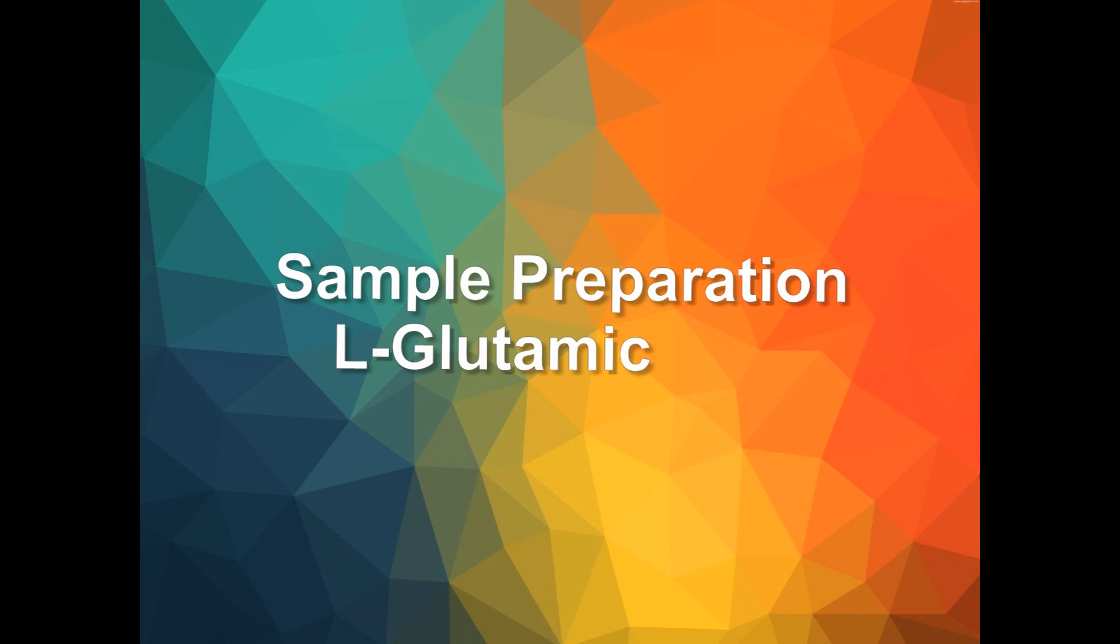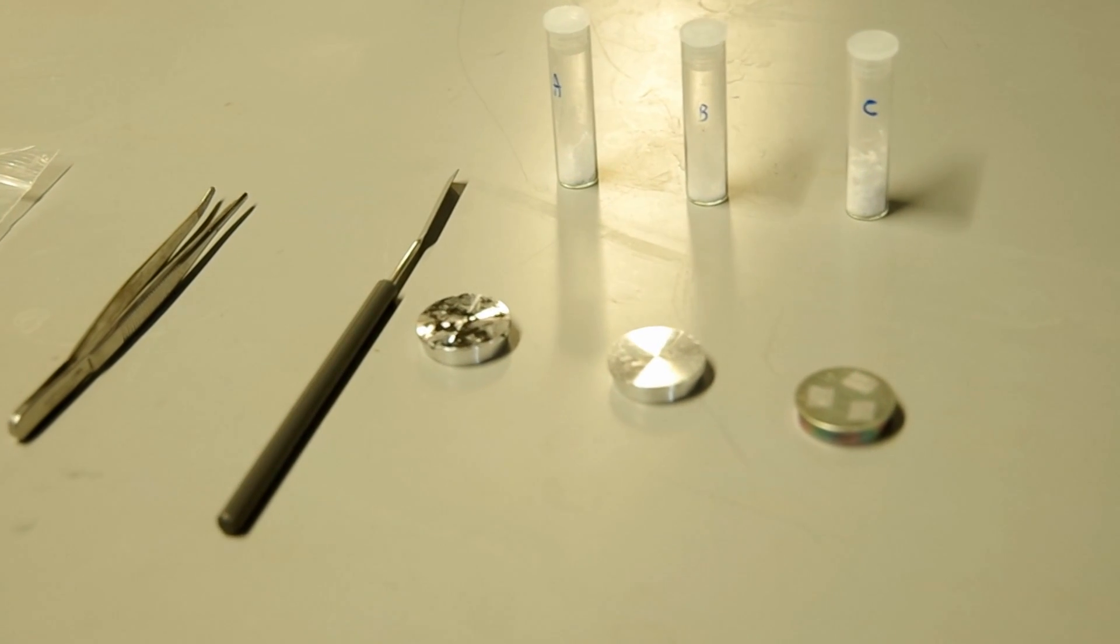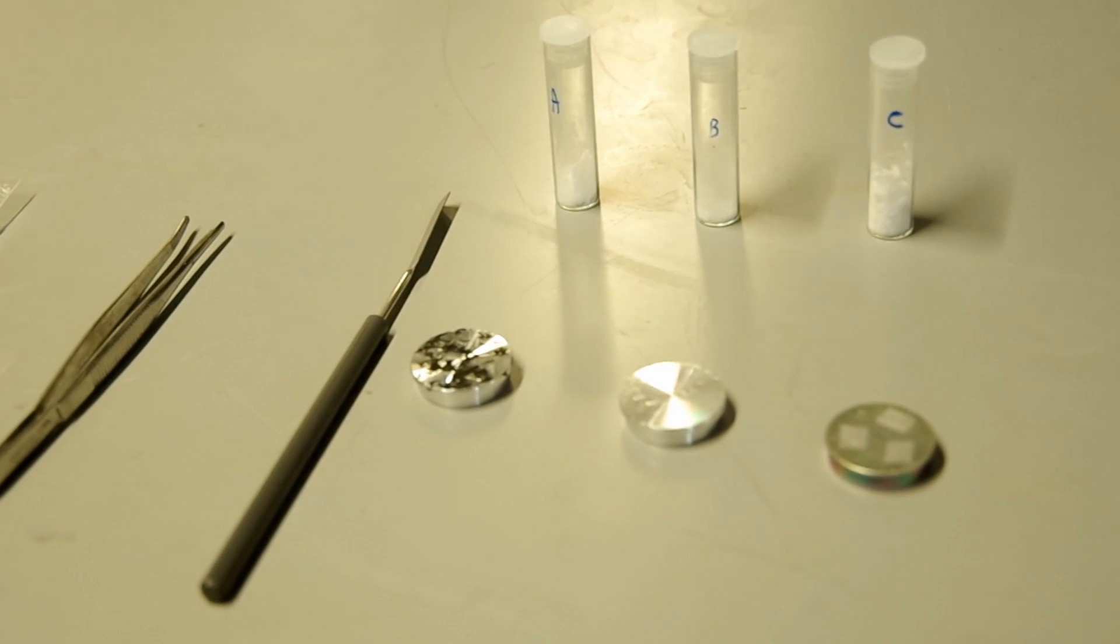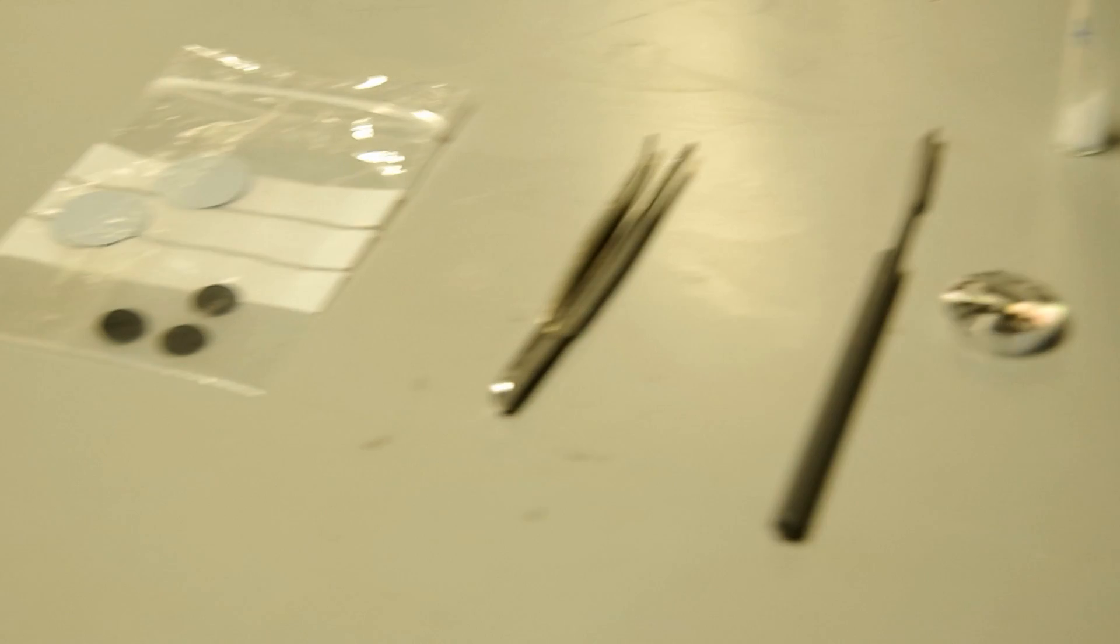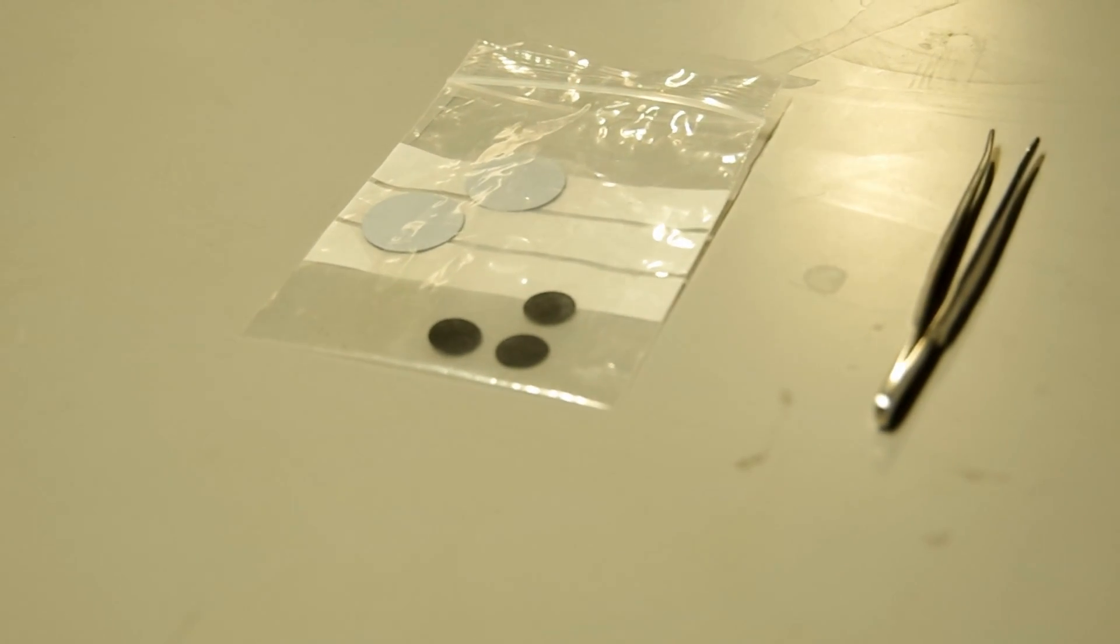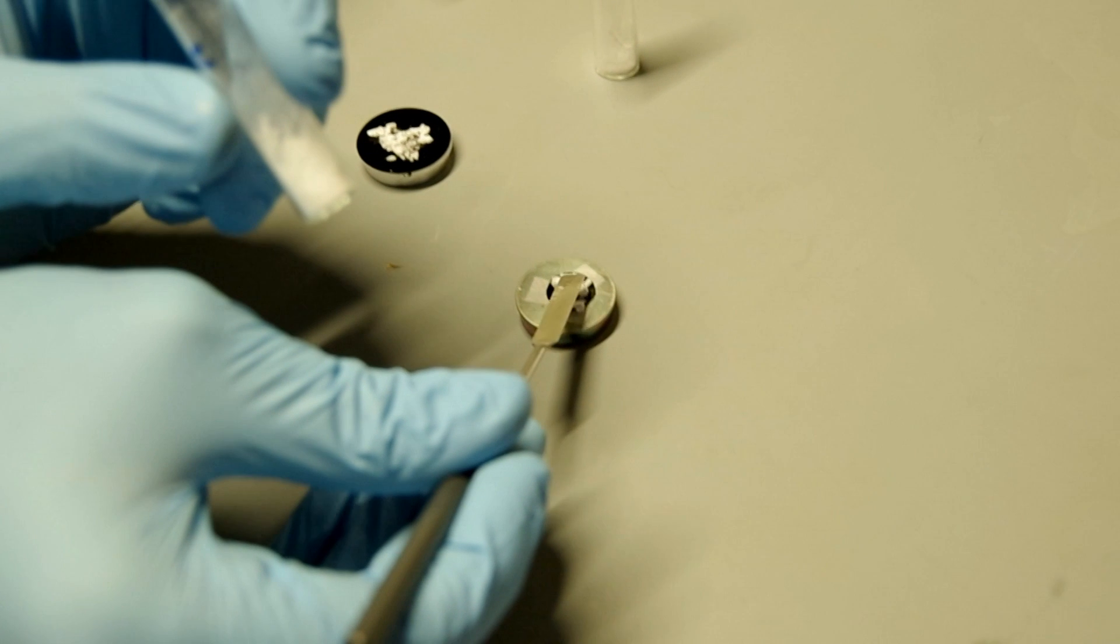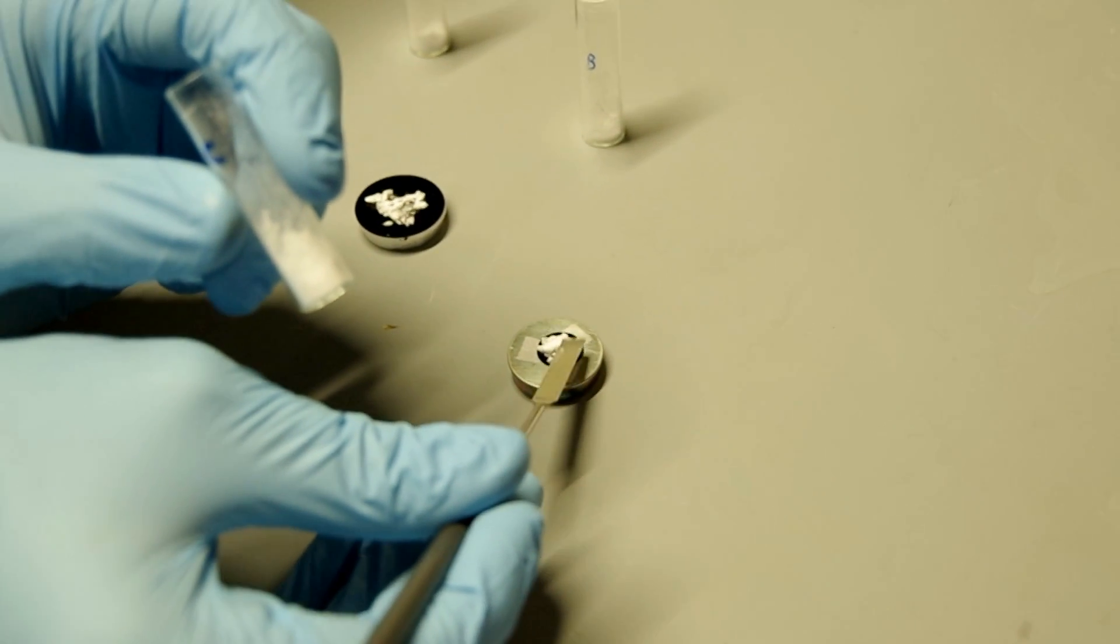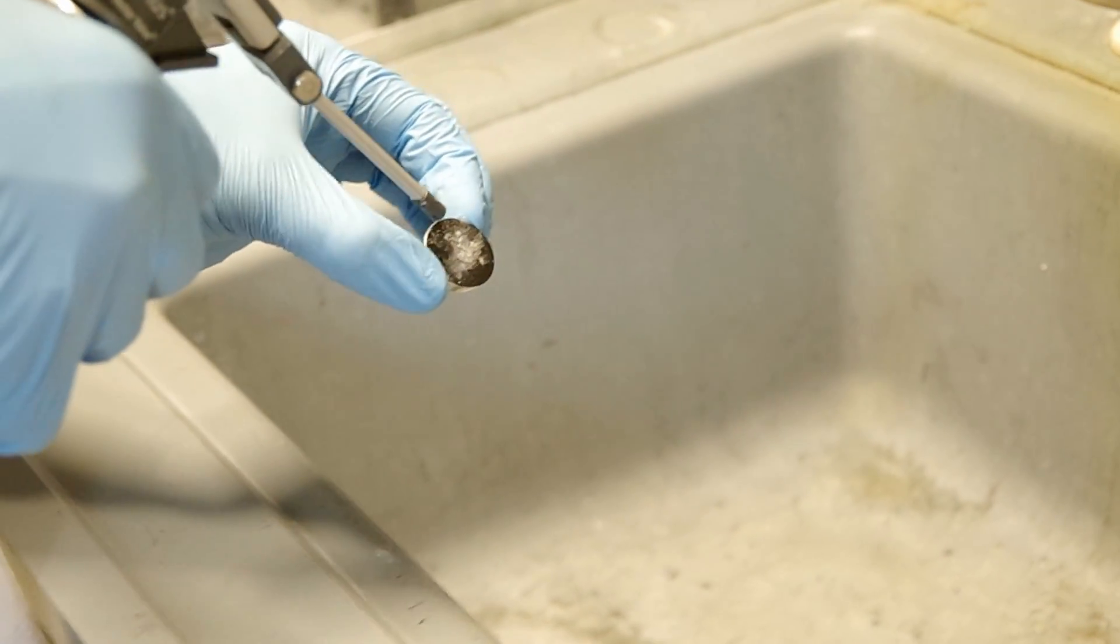Now, let's look at the sample preparation with L-glutamic acid as an example. To do the sample prep, we need sample stud, a spatula, tweezers, and carbon conductive tape. Attach the carbon conductive tape to the sample studs, and use the spatula to put the sample powder on the tip. Use an air gun to blow off the redundant powder.